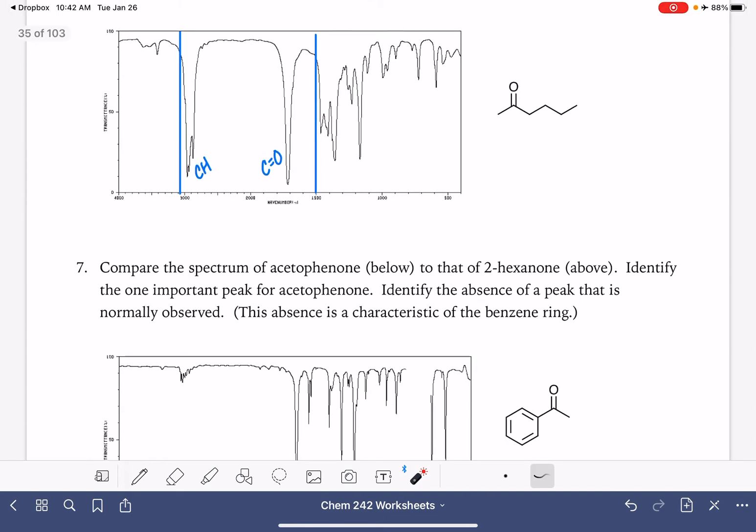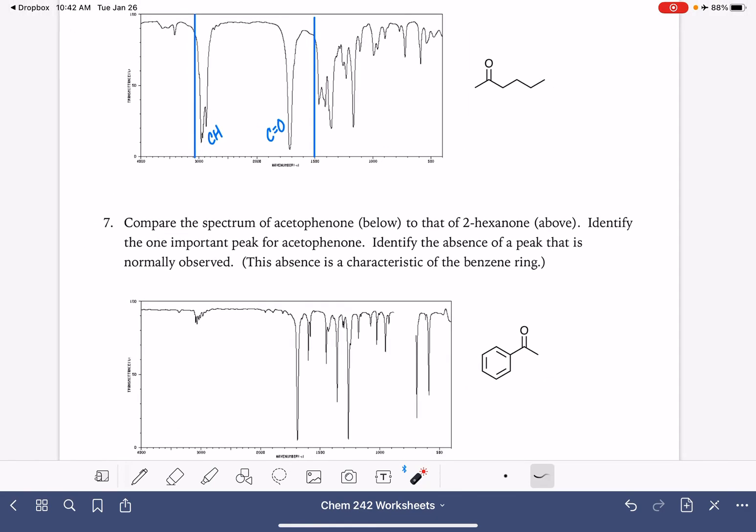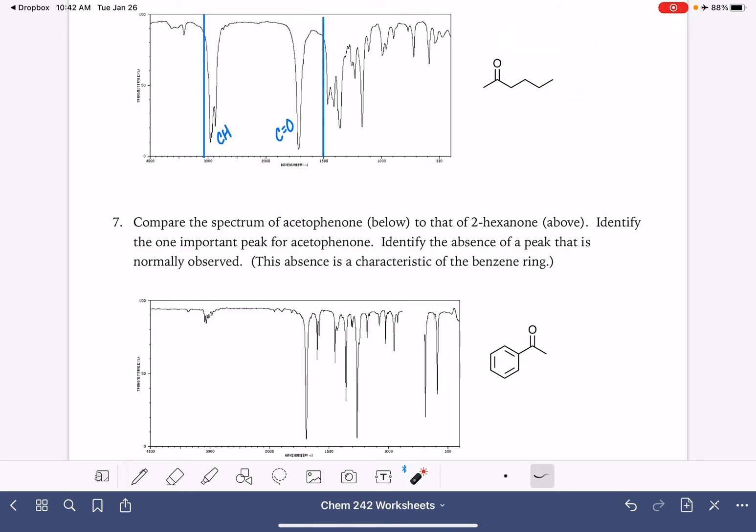Now we're going to do a comparison. Acetophenone, which is this molecule right here, comparing that to hexanone right here. Identify the one important peak. So let's mark off our 1500. We actually have two important peaks. I don't know why I said one. We'll mark off our 1500. We'll mark off our 3000. We're going to ignore this. This is our carbon oxygen double bond. Right after I just said that it's not going to be sharp and spiky, there it is sharp and spiky, of course. IR is not always 100% reliable. This right here looks like our carbon carbon double bonds. Definitely not in this place that I would normally expect to see it, but carbon carbon double bond peaks are oftentimes only medium strength, whereas carbon oxygen are strong.